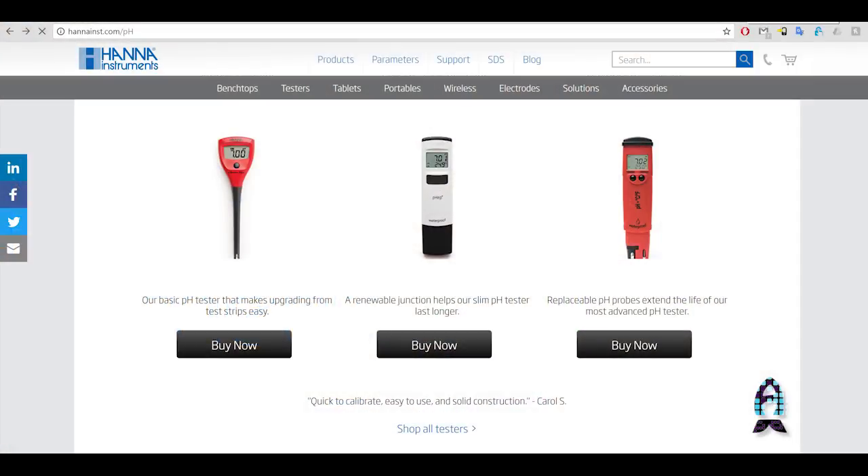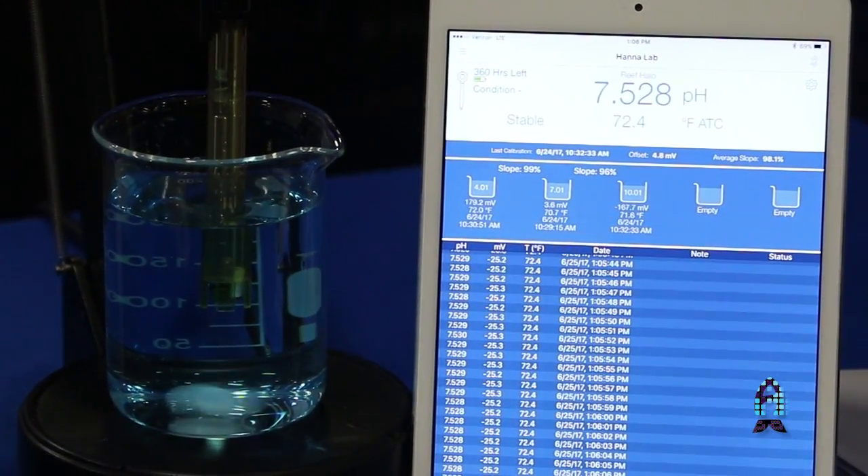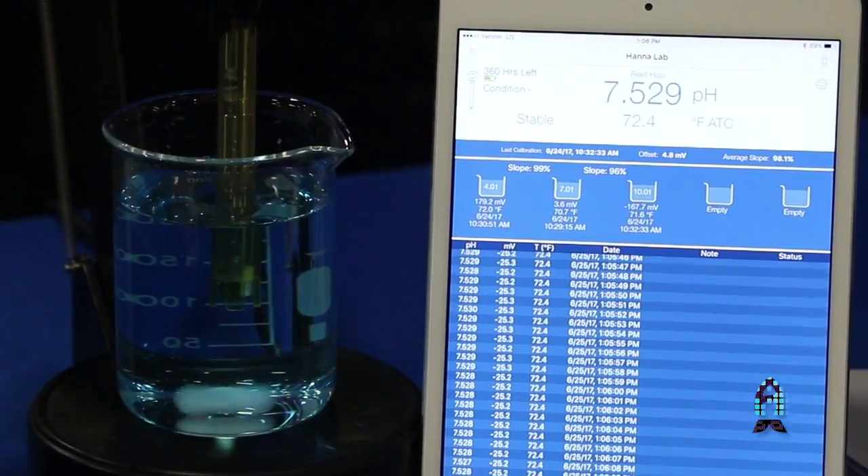We have a lot of really affordable handheld testers which are great, but they lack a lot of features you would get in something like this. You don't know when the last time you calibrated was, it's not going to record the data, you're not getting that increased accuracy, and you're not going to be able to read the result all the way to the thousandths place, which does have some nice features to it.